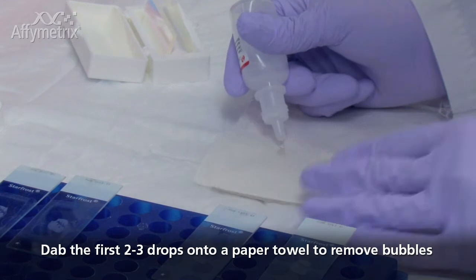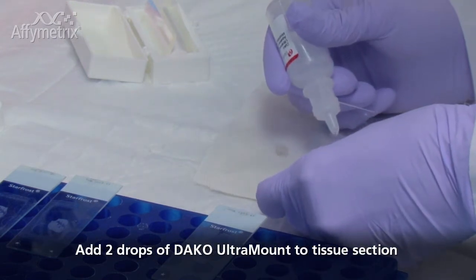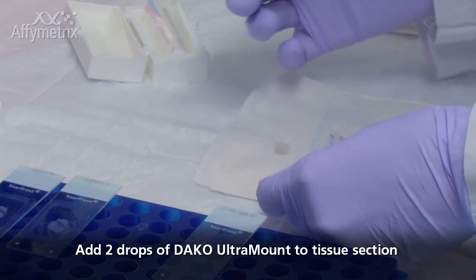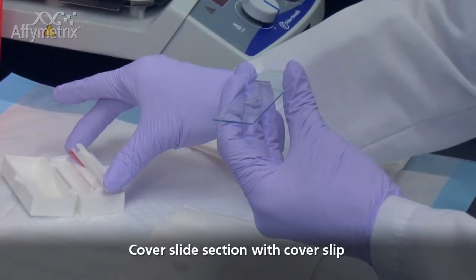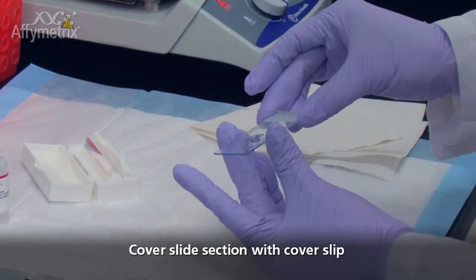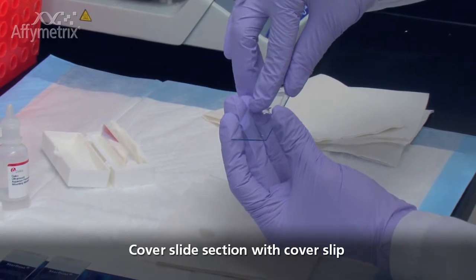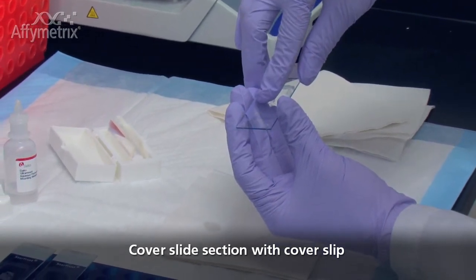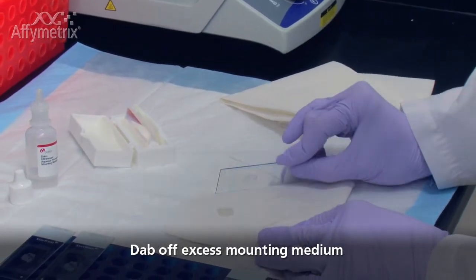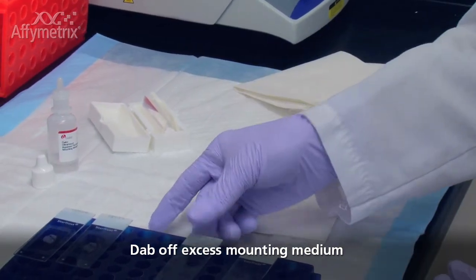Before adding mounting media, make sure the slides are completely dry. Add a minimum of two drops of DACA Ultra Mount Mounting Medium to tissue sections without making any bubbles. Cover the slide section with a piece of 24mm by 55mm cover slip. When placing the cover slip over the tissue section, it is helpful to do so at an angle. Do not completely let go of the cover slip until it comes into contact with the mounting medium. This will help reduce any air bubbles. Store the mounted slides at 4 degrees Celsius to avoid bubble formation over time.